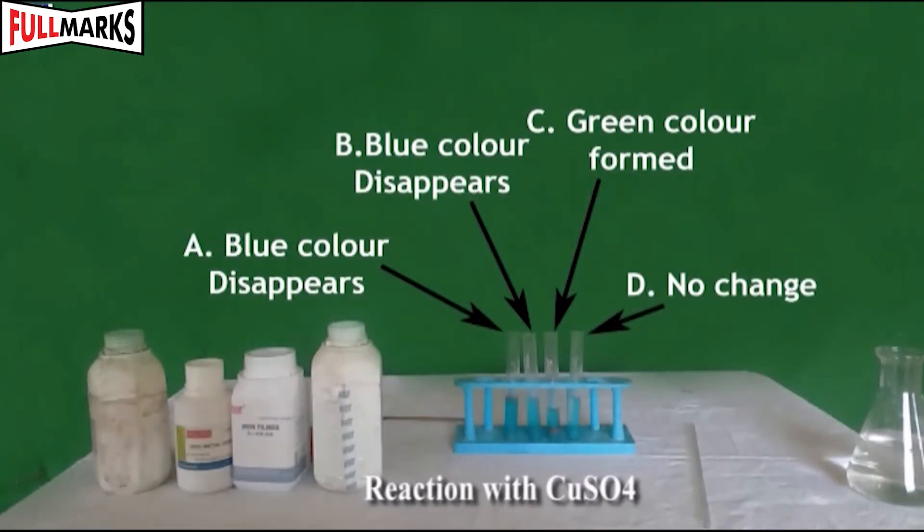Now in test tube A, the blue solution of CuSO4 becomes colourless. In B, the blue solution of CuSO4 becomes colourless. In C, the blue solution becomes green. And finally in D, there are no changes.